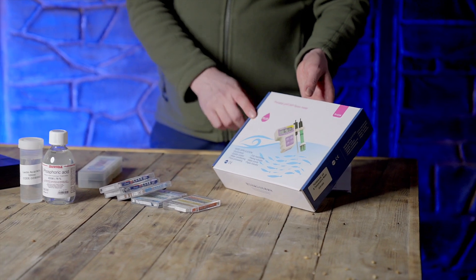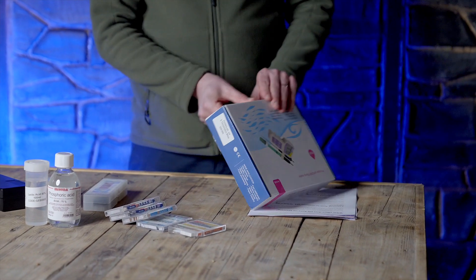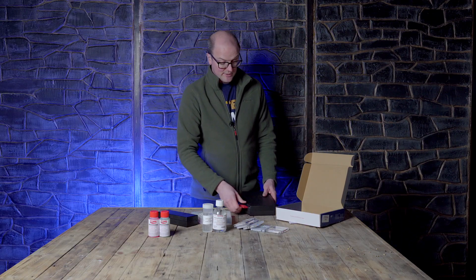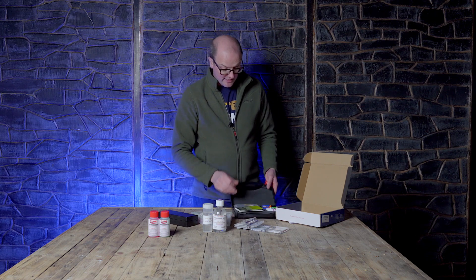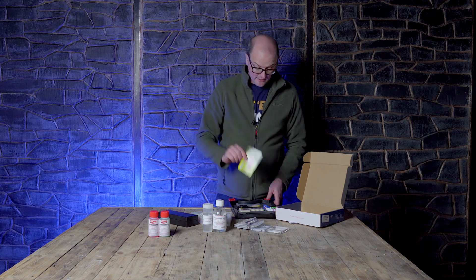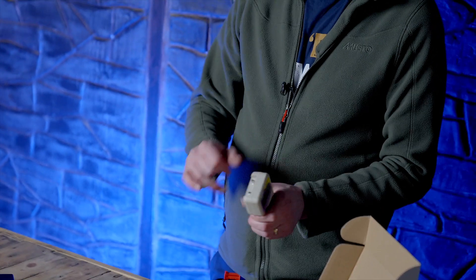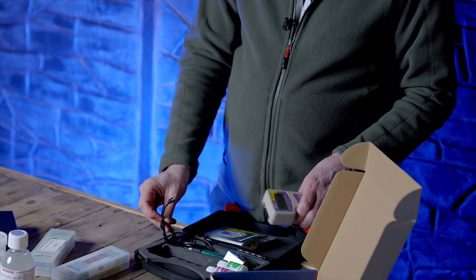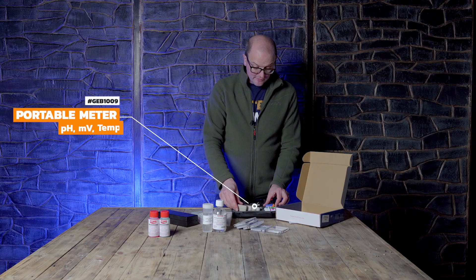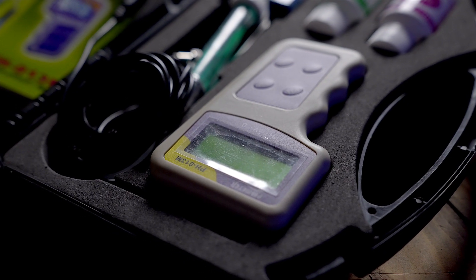We also have this portable pH and temperature reader — it's really good quality, almost good enough for commercial brewers at a small scale. It comes in a nice carry case with good ancillary accessories, a little operational manual, and a premium handheld unit with quality controls. It comes complete with batteries and buffer solution as well. So there are lots of different options for lots of different budgets.